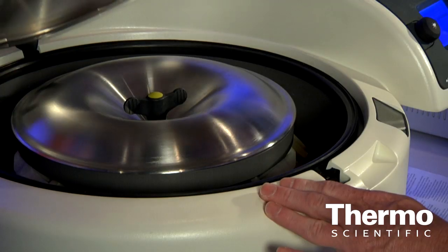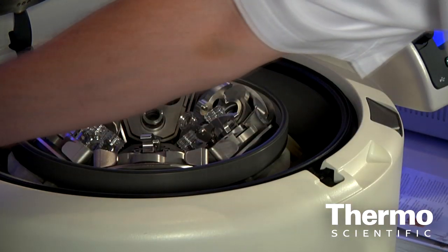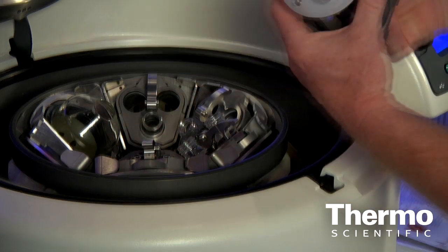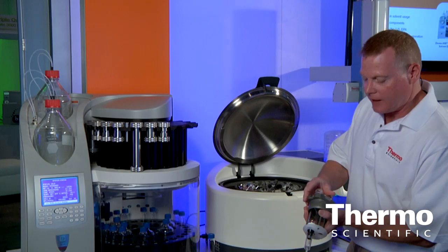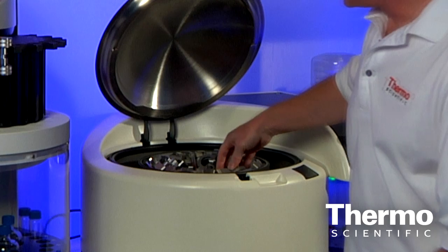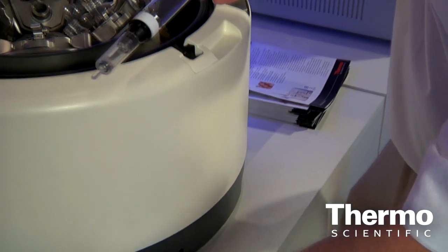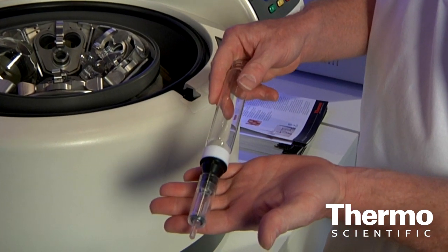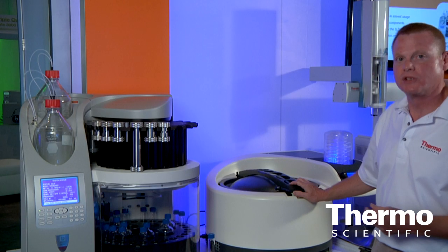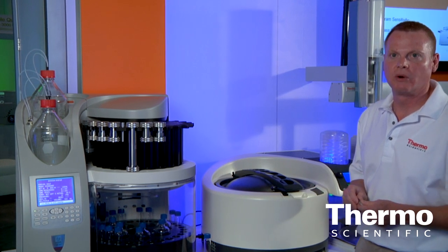The Rocket evaporator is designed to rapidly evaporate the solvent directly into an autosampler vial — many GC or LC autosampler vials are compatible. The advantage of evaporating directly into an autosampler vial eliminates the need for transferring sample back and forth between different containers, reducing the cross-contamination and sample losses that often occur when going between different bits of glassware. The Rocket will also collect the solvent that is evaporated, making it a very environmentally friendly and green addition to our laboratory.